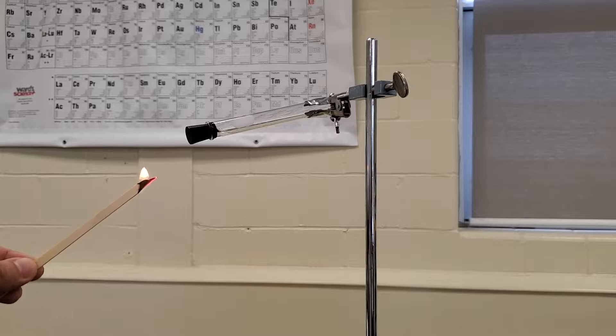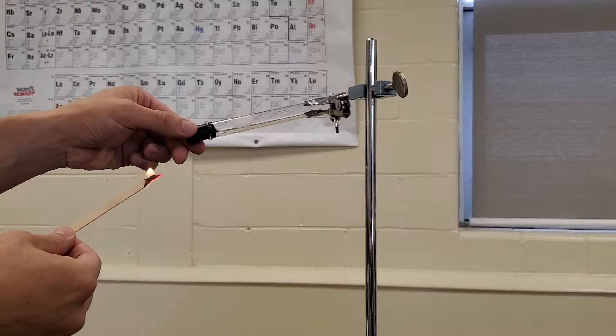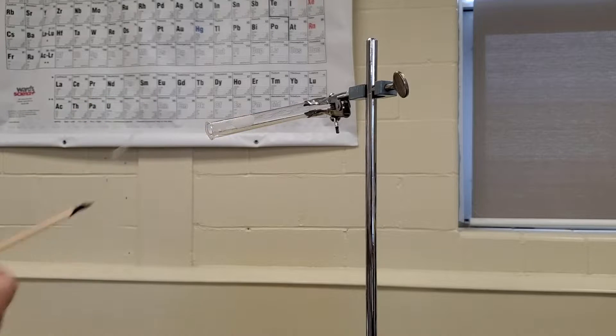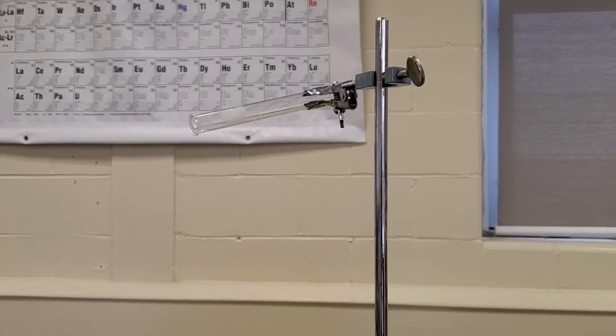Let's combust the hydrogen gas by doing a flaming splint test. We're going to bring a flaming splint towards the mouth of the test tube and react it with hydrogen gas. That squeaky pop is a property of hydrogen gas.